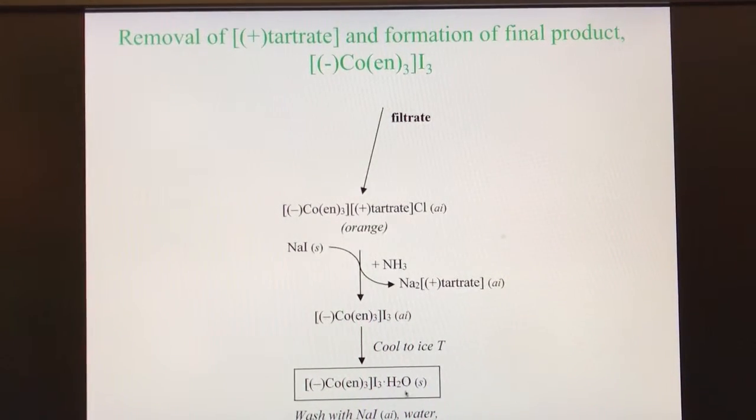You will notice that here is a water of hydration, and that is trapped in the crystal structure. That is very common and nothing to be concerned about. We do have, also just want to point out, there are often with syntheses washing steps, and so washing with this salty water, essentially with the sodium iodide salt, as well as water, ethanol, and acetone.